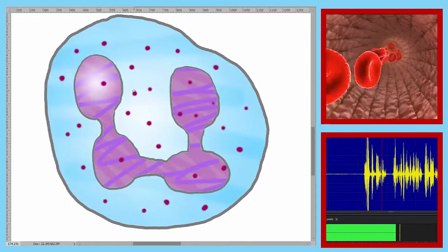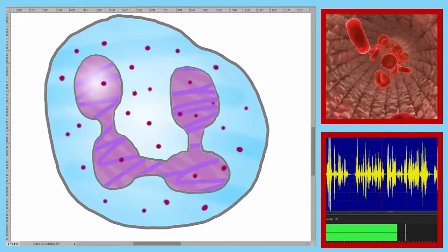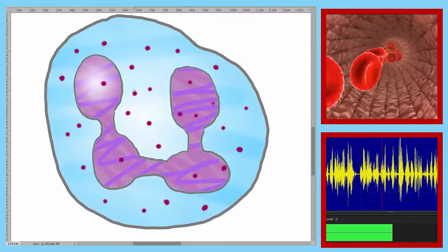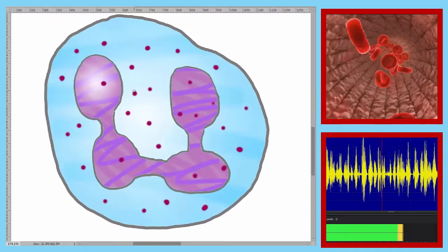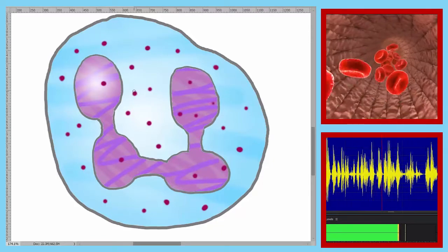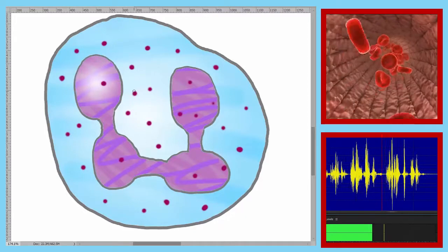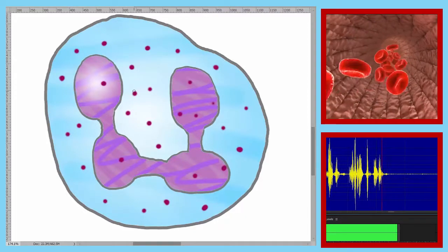This is our fifth formed element. The most conspicuous feature of this one is the nucleus. The nucleus is multi-lobed. This formed element may have anywhere from 3 to 5 lobes of its nucleus. The nucleus has a violet color, and there are also granules within the cytoplasm. These are reddish violet granules. And so that's our fifth formed element.